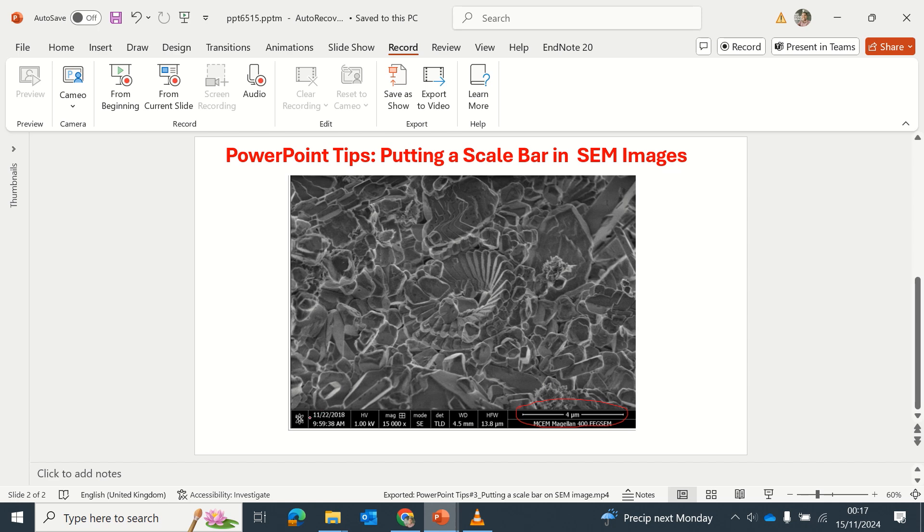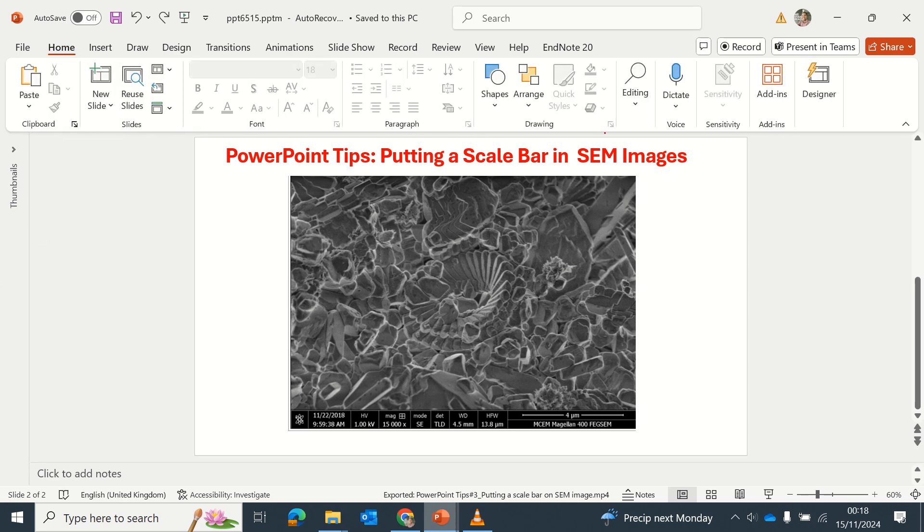The reason I'm showing this is because in most cases when you are writing reports, this information is not required in your report. So now I want to just show what I usually do with my images.